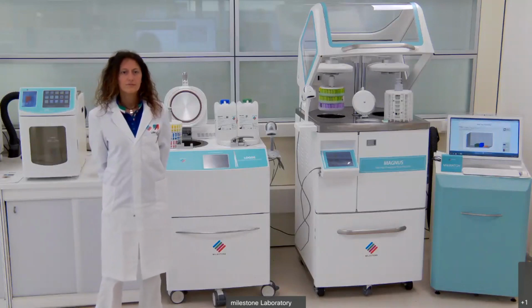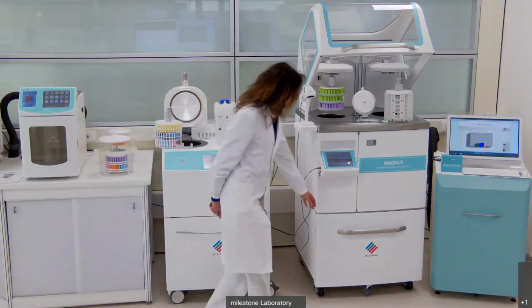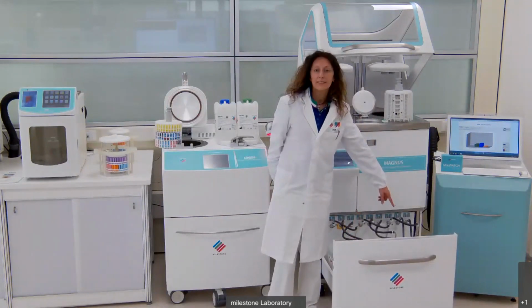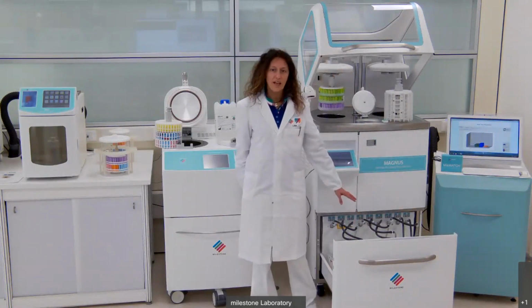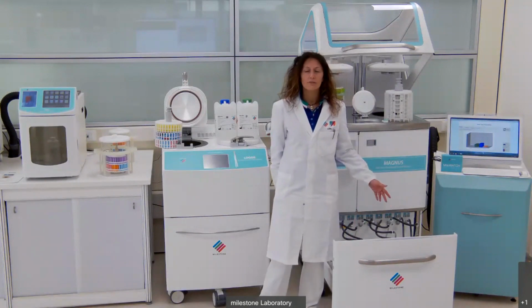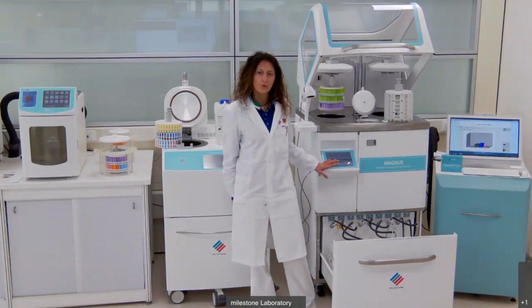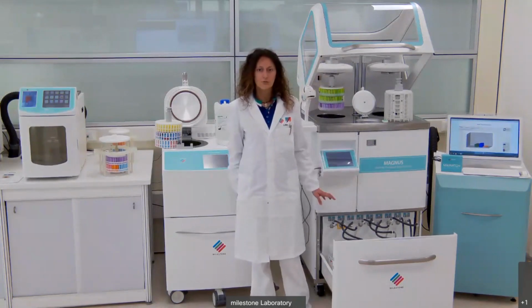Okay, let's read another question about Magnus. How many tanks can I use in Magnus? In Magnus, you can insert up to 9 tanks. But for the processing, you need only 7 tanks. So you can put other spare reagent in position number 8 and 9. In this way, when, for example, ethanol expires, the software will automatically use the new reagents, avoiding the immediate action of the user.